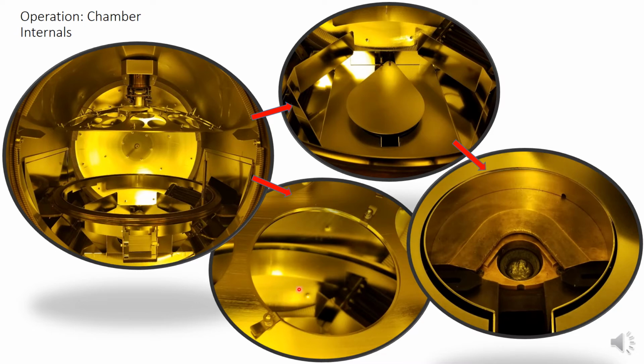If you have small chips, you can affix them to a carrier wafer with copper or Kapton tape, and then place the carrier wafer in one of these slots. Looking down into the chamber, we will see the shutter. On the main control screen, we can hit the shutter open button to reveal the hearth underneath.